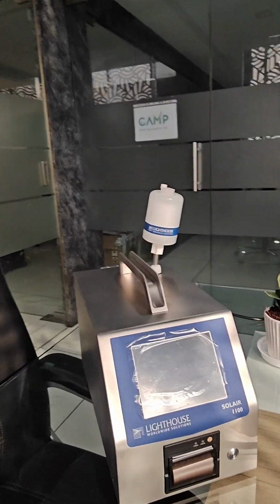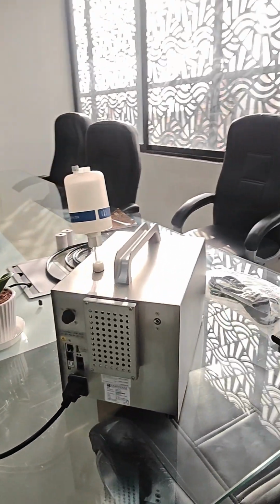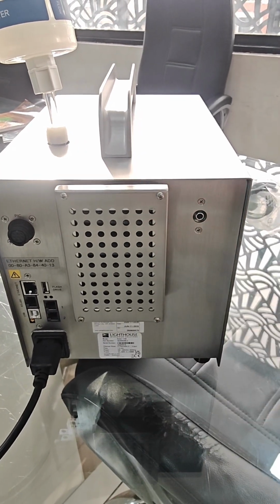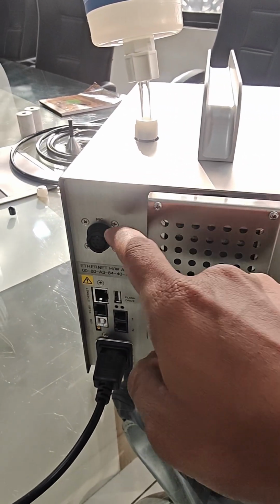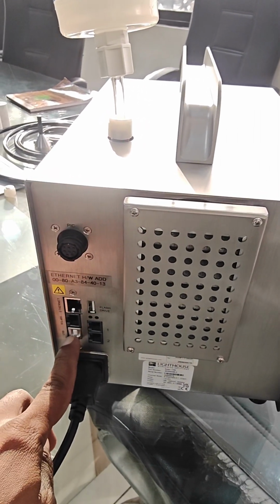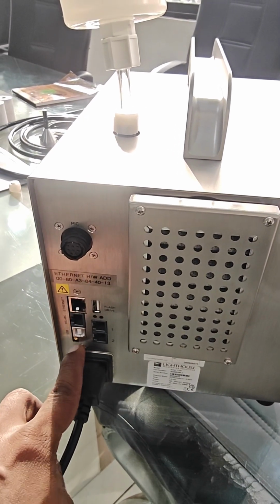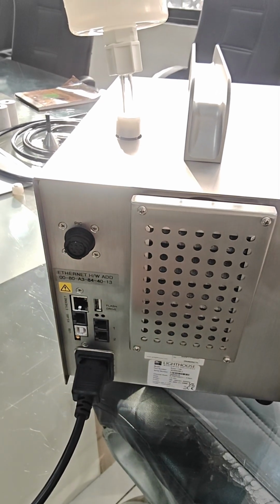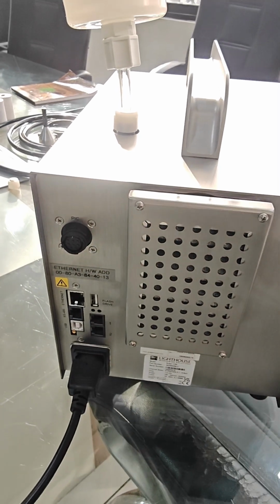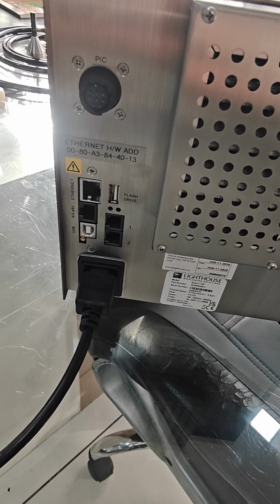This is the instrument. Outer dimensions. The back side, there is a HEPA filter exhaust with some connectors, PIC connections, Ethernet connections, RS485 connection, USB connections. This is pocket MCA connections for calibration purpose. This is USB drive for data downloading as well as firmware downloading, and this is for temperatures, humidity, differential pressures, and other accessories connections.